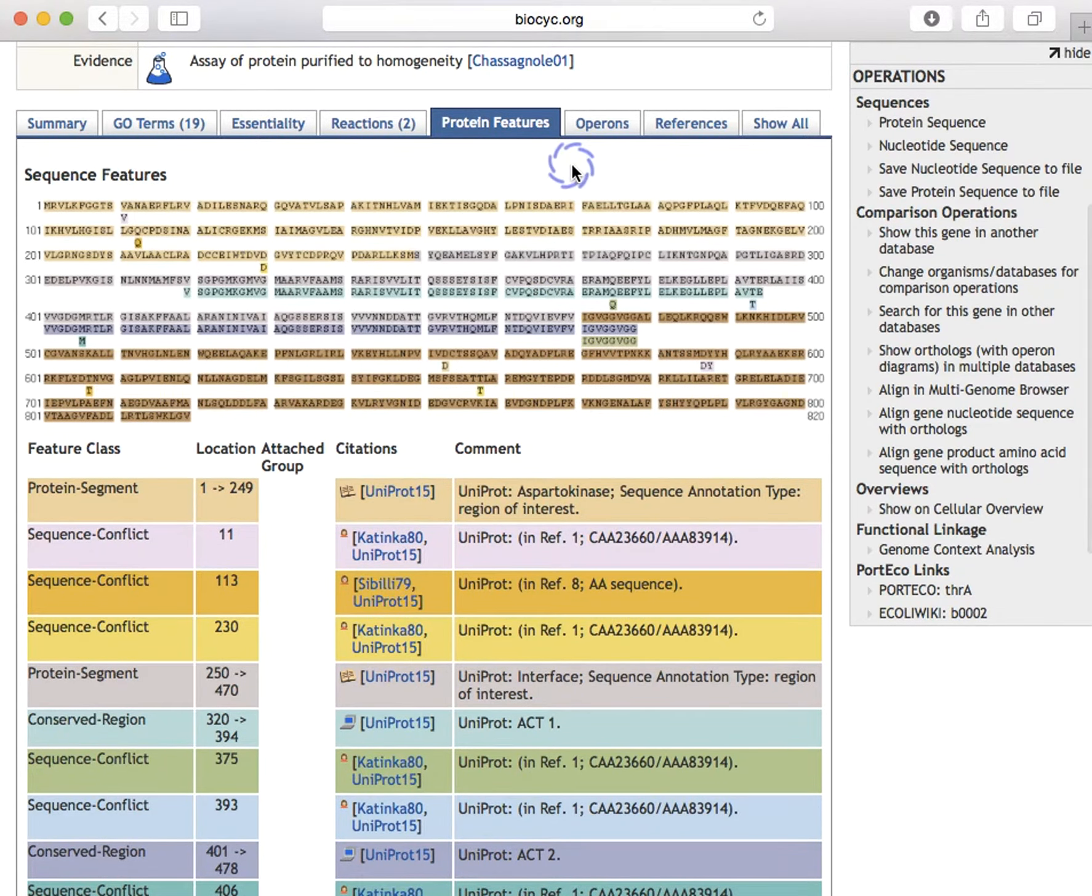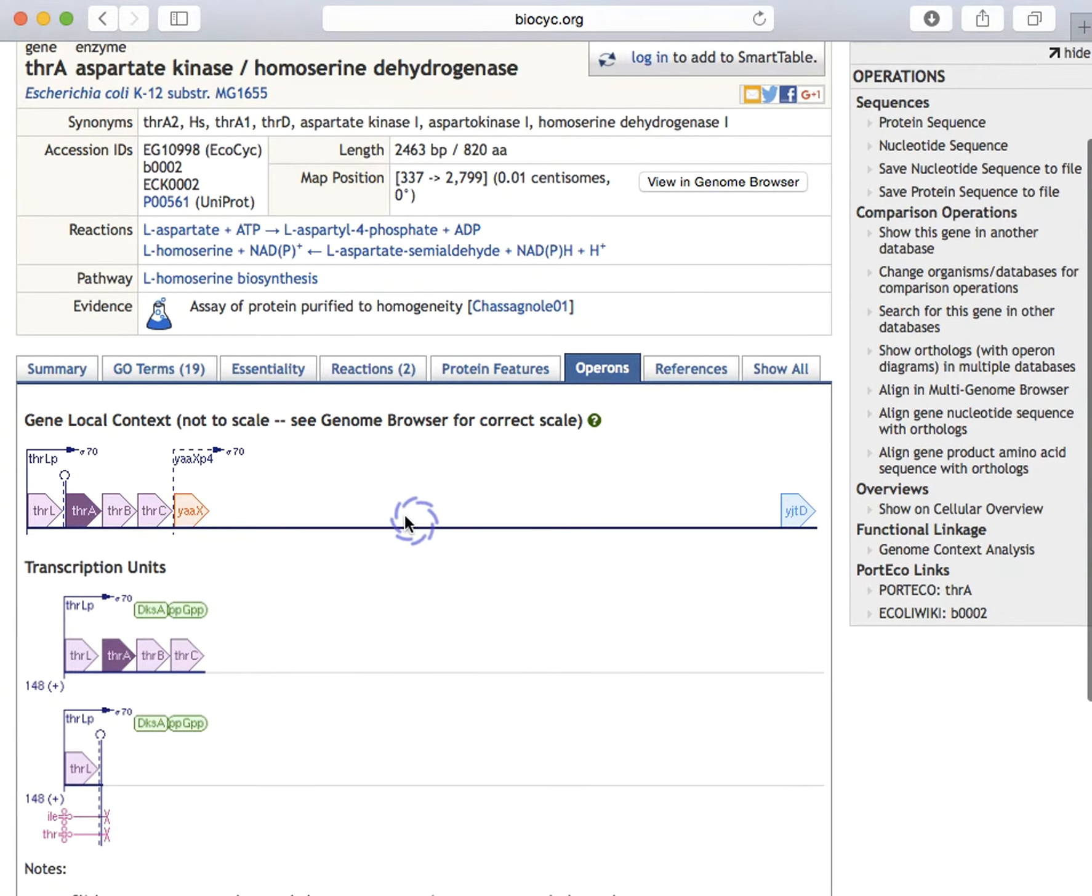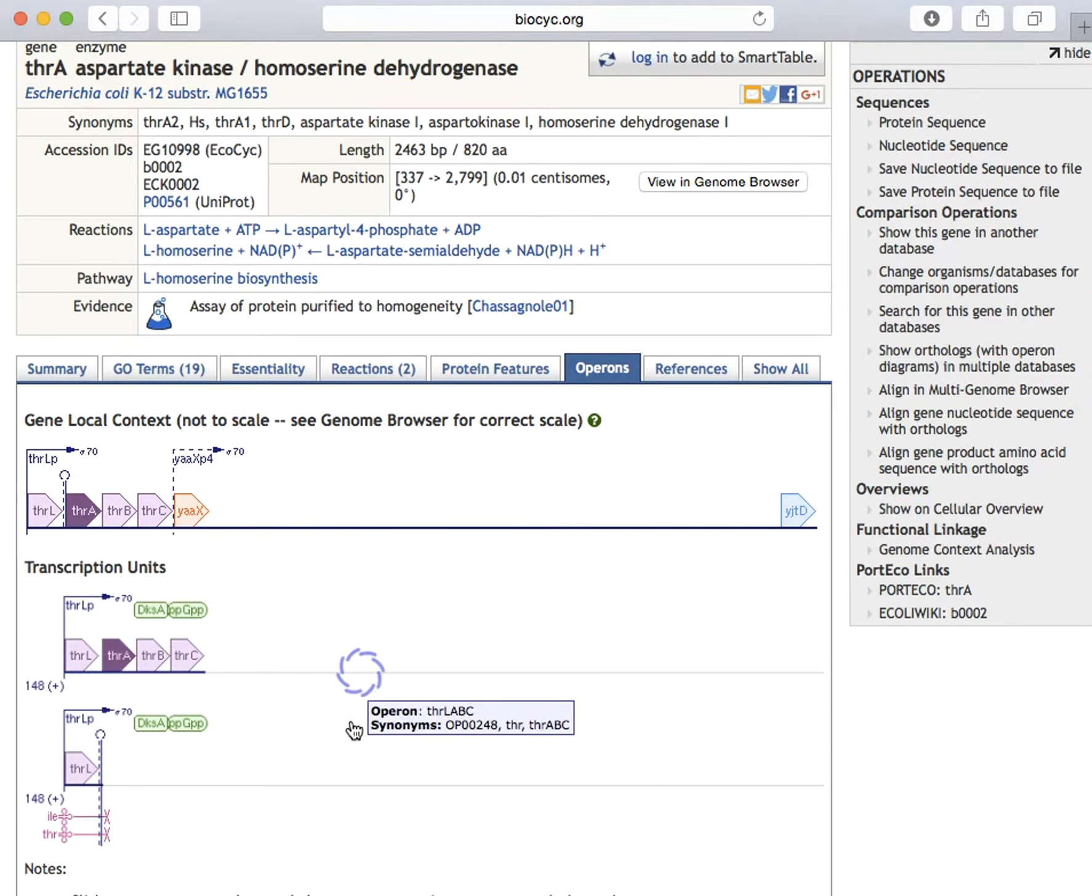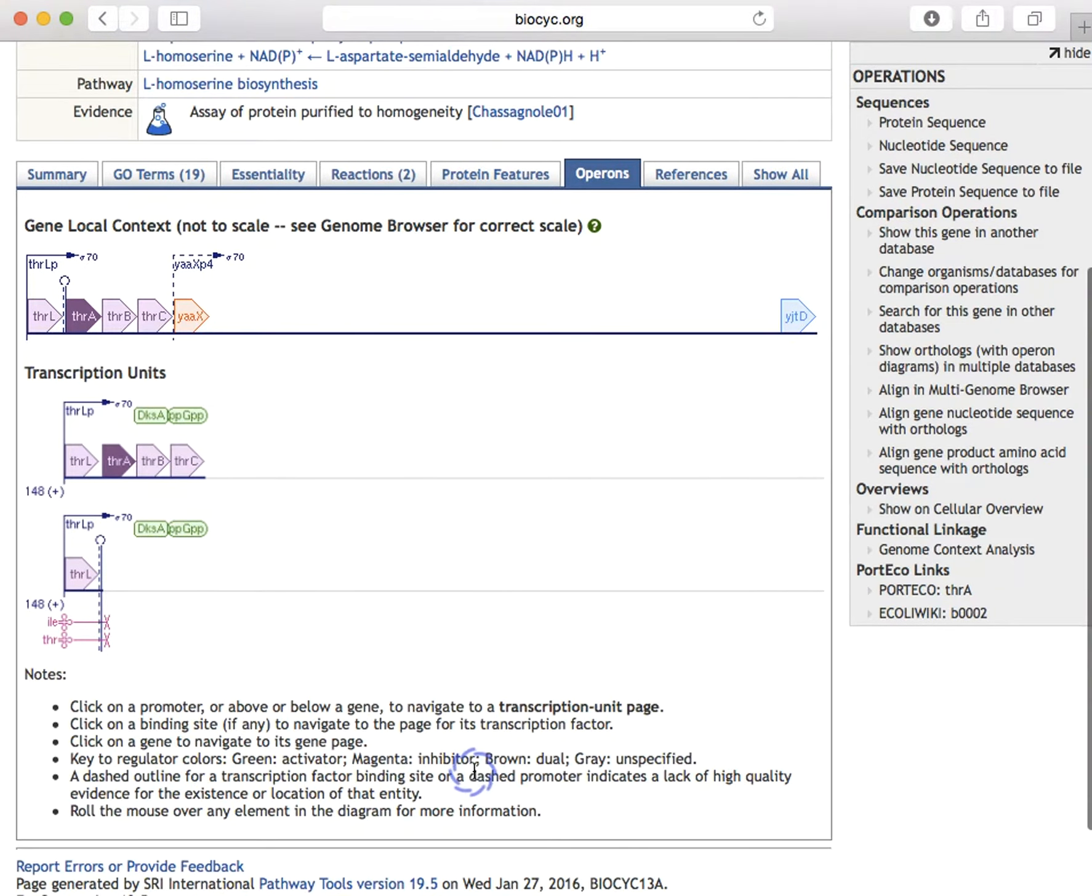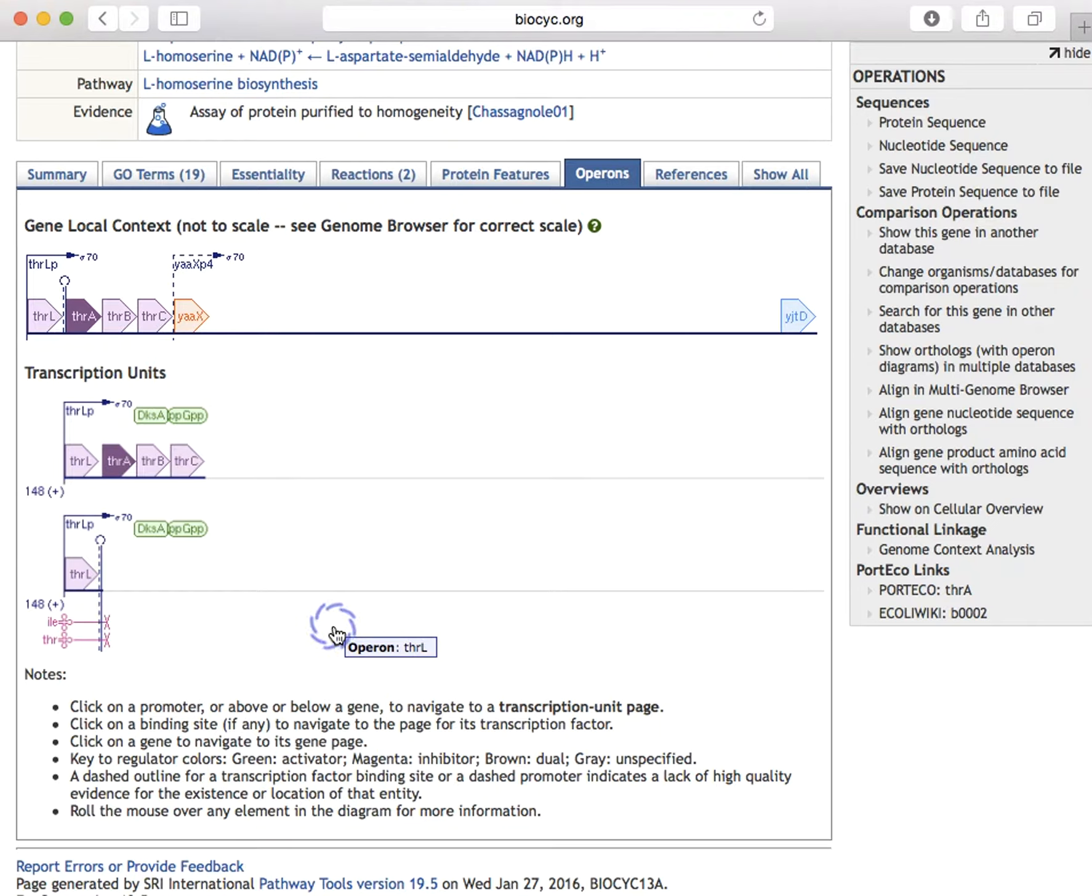The operons pane shows the operon containing this gene plus one additional gene on either side of the operon. Furthermore, for clarity when there is more than one promoter, we draw a separate diagram for each transcription unit corresponding to each promoter. A transcription unit is a group of genes controlled by one promoter. And note that by definition, operons must contain more than one gene, whereas some transcription units contain a single gene.